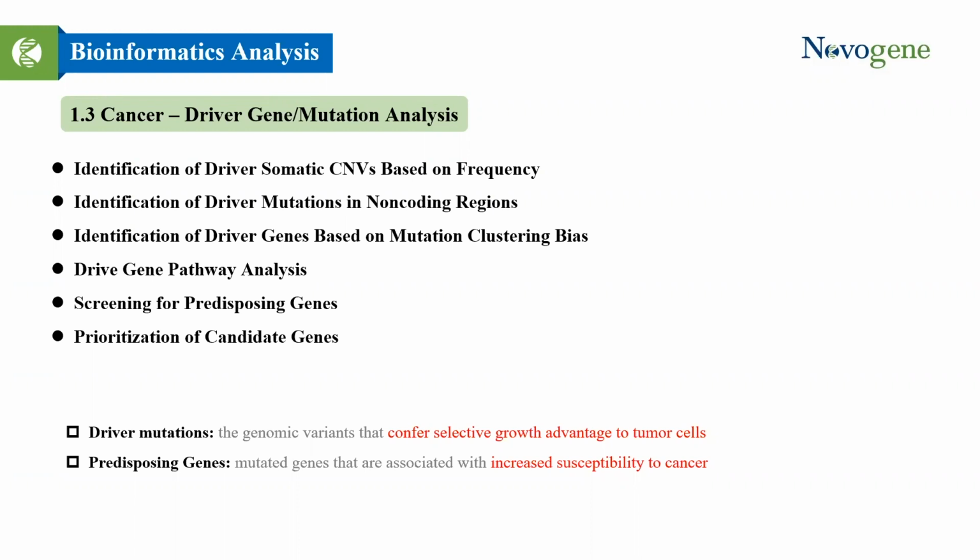Targeting this special mutation type, we have driver gene and mutation analysis, where we can identify driver somatic CNVs, driver mutations in non-coding regions, and driver genes based on mutation clustering bias. Besides, for the driver genes, we also conduct the pathway analysis.